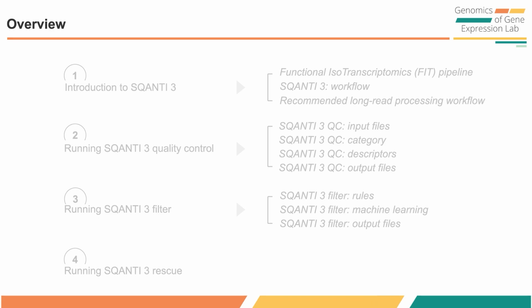After quality control, we will show you how to perform filtering with SQANTI3. Users can filter their transcriptome based on their desired criteria using rules or machine learning filters. Also, we will walk you through all the output files in the filtering steps.